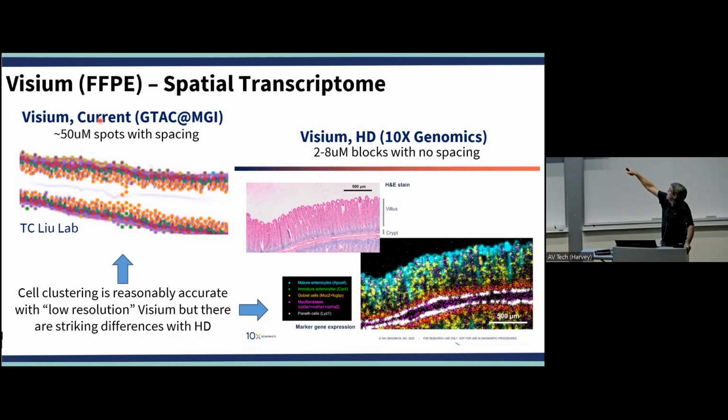Over here, you can see how much better the resolution is on the HD. So what you see over here is the villus structure. You can actually even see, I don't know if the battery's not working.